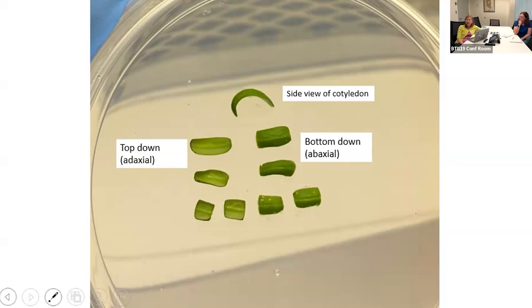It's another thing to have healthy protoplasts that go on and divide and make callus. And I know there are certain applications, especially with genome editing, where people want to use protoplasts. And I just find that when trying to train people, it's easier to train them on transformation with something like cotyledons than doing protoplasts.